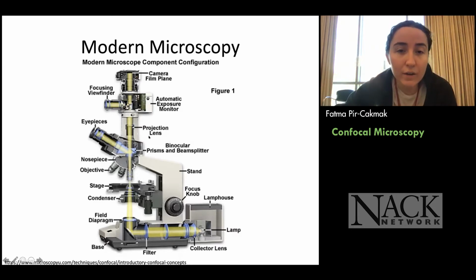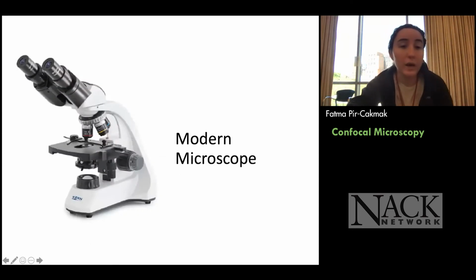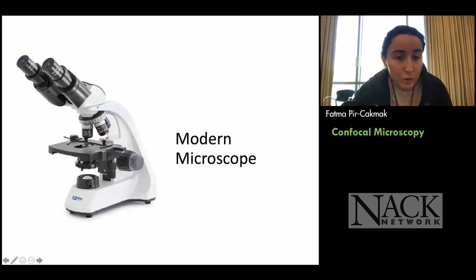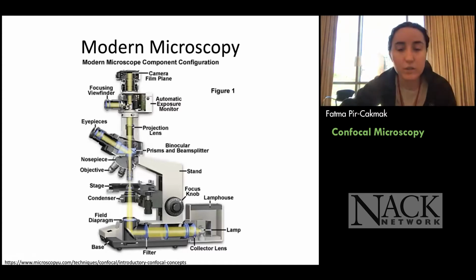So what you have here is usually just a general microscope. I'm just showing the body of the microscope. You put your sample here, and this is your lens. You can look at your sample under this, and this is a light source. This is a simple one, and you can have other types. If you want to look at a fluorescence microscope, you have other sources like laser power. You can see here the light is coming through the sample.